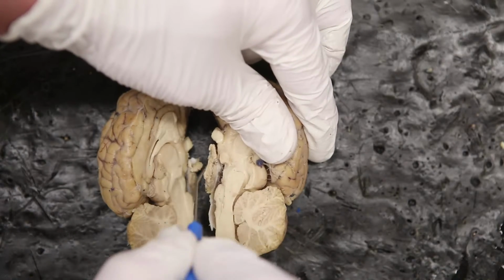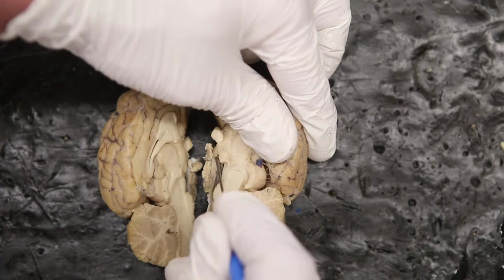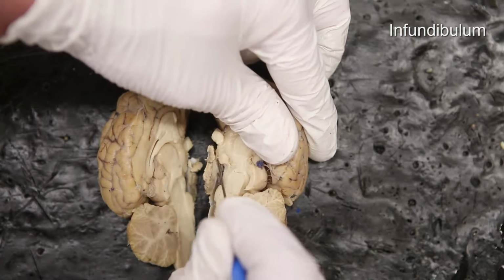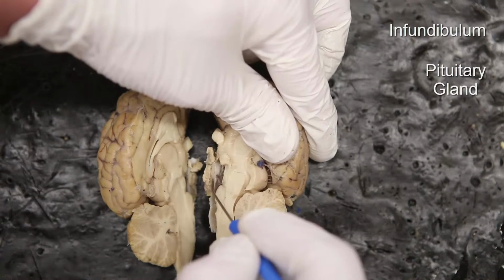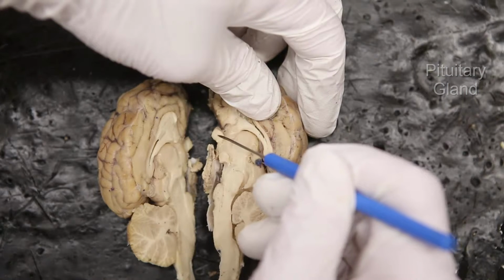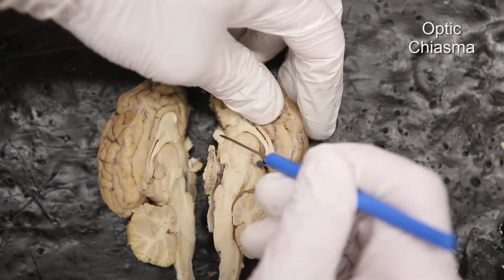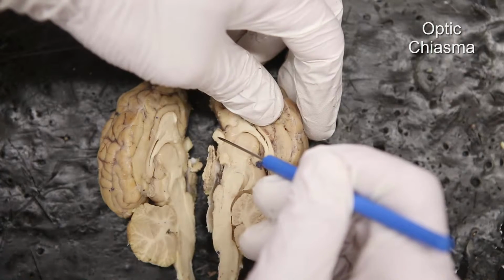Coming off of the hypothalamus, we're going to have this connection point here. This is part of the infundibulum. It's running down to the pituitary gland. If we come back up, right here is the optic chiasma. This is where the two optic nerves are going to meet and cross over.